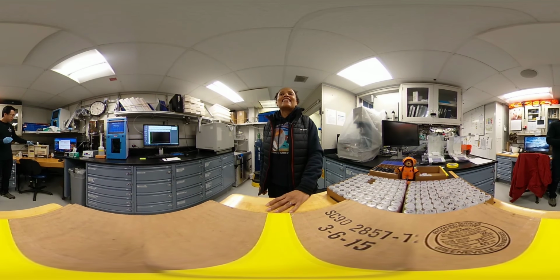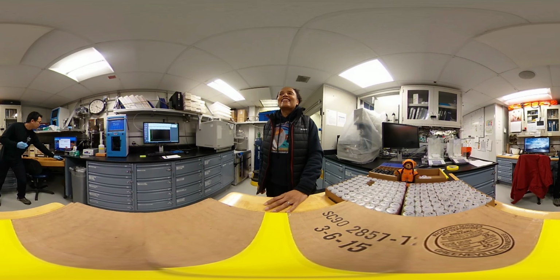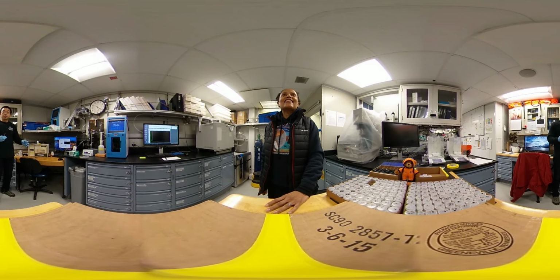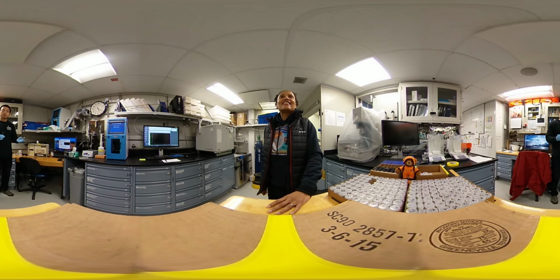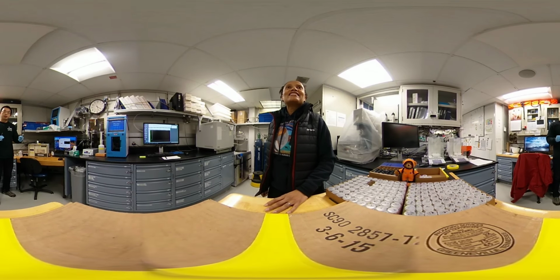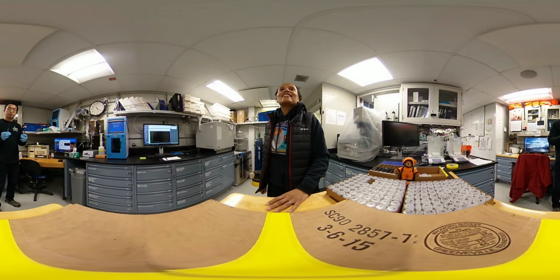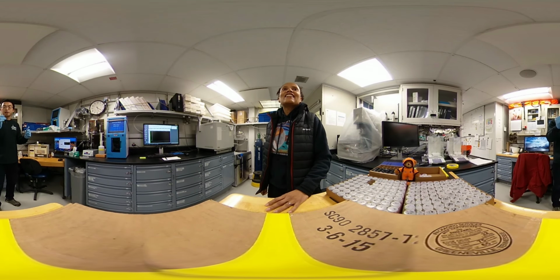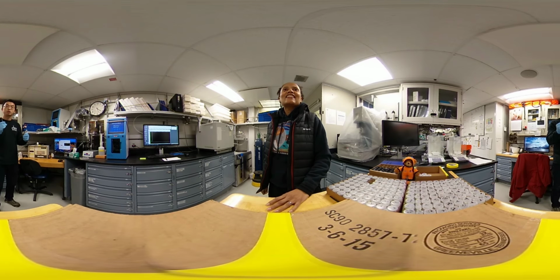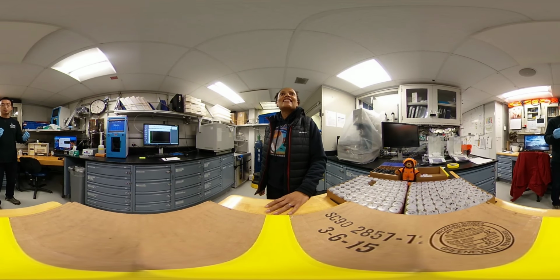We put the sample in there, click the software, and the balance will keep measuring based on how many times you need. Then we average our measurements and get a more accurate measurement for our samples. Every sample measured will be divided into two ways. This is for the CNHS analyzer, where we measure total carbon and nitrogen and sometimes sulfur.